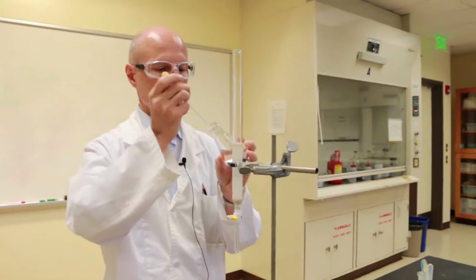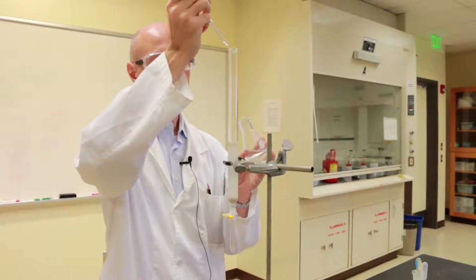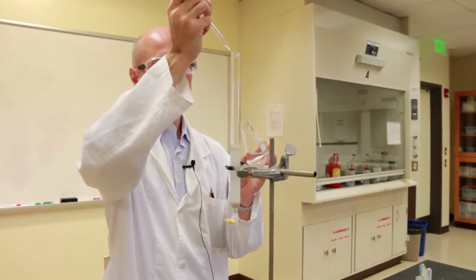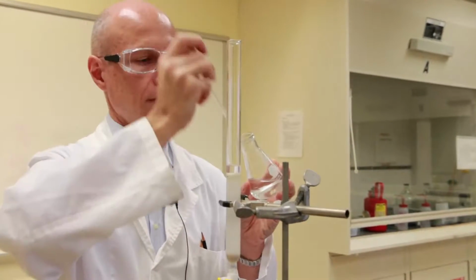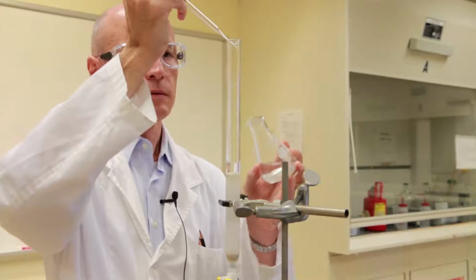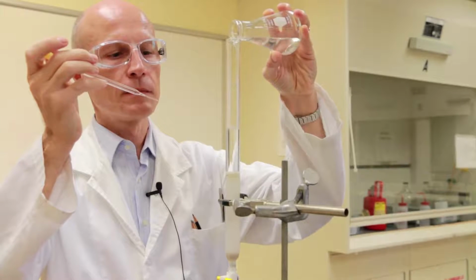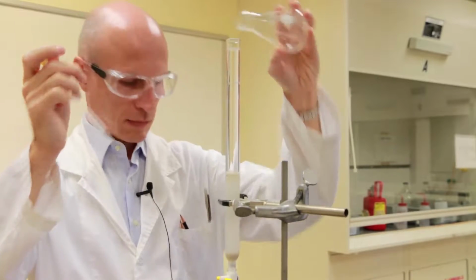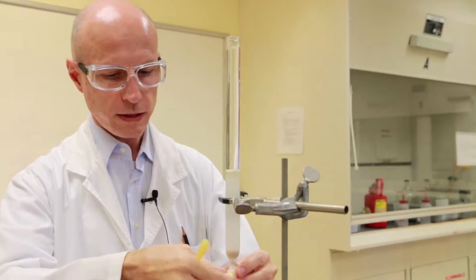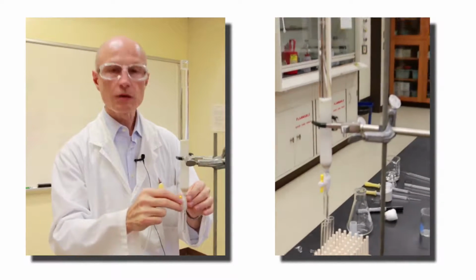So you can add your eluting solvent very slowly at the beginning so you don't disturb the surface of the silica gel. And then more briskly until the column is full. Now you're ready to run, so you can open the stopcock and you will start collecting small fractions in test tubes. And this concludes your column chromatography video.